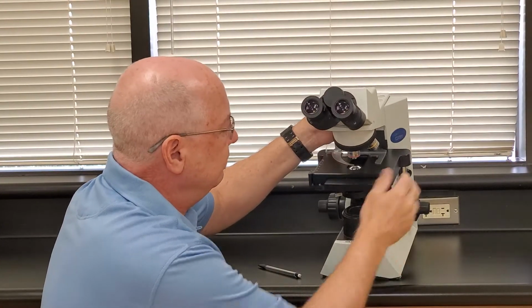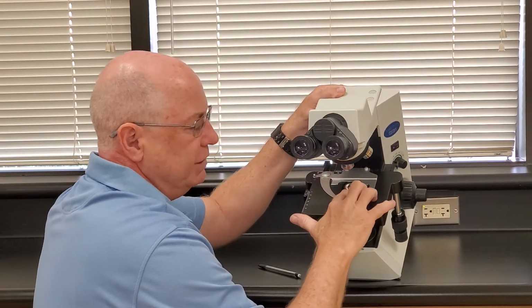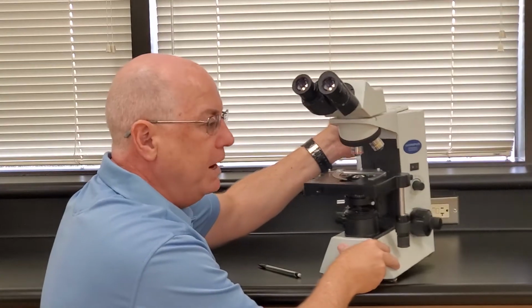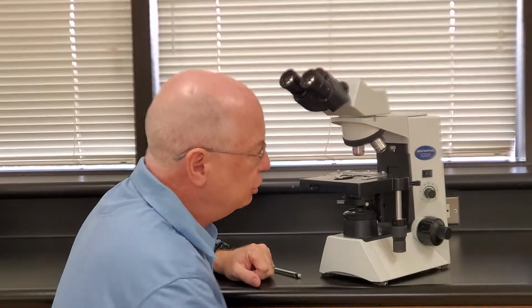And if you look from the top of the stage, there's a big hole in the stage that has this little lens in it. That's the condenser lens. Just know it all as the condenser. But the point of the scope is when I mount a slide and I turn it on with the power switch and I turn the light up, I'm going to center the slide.